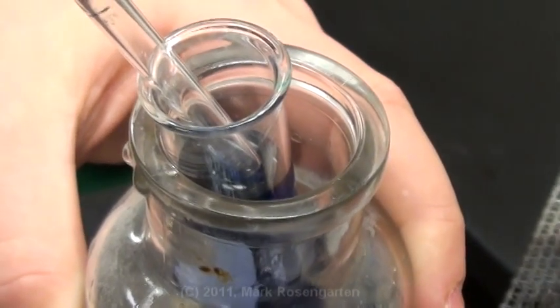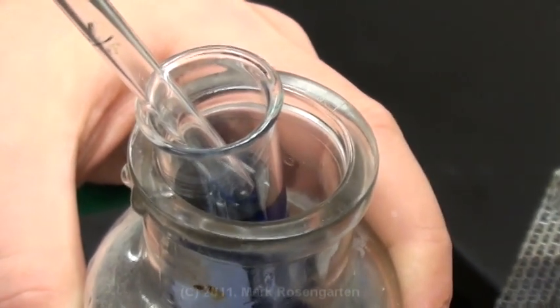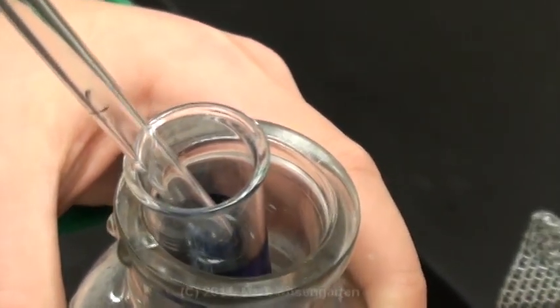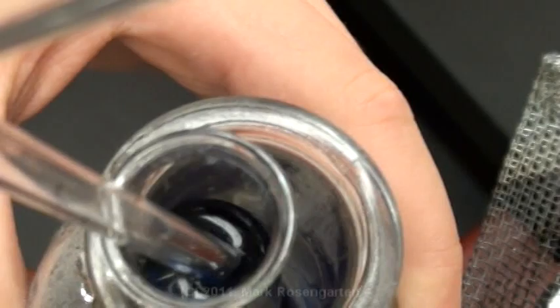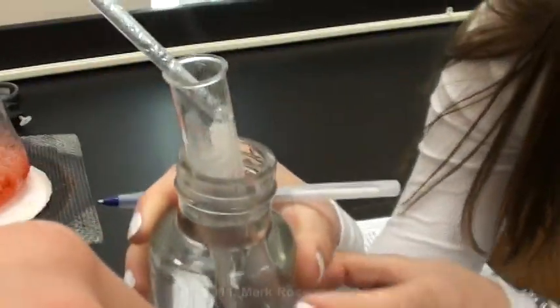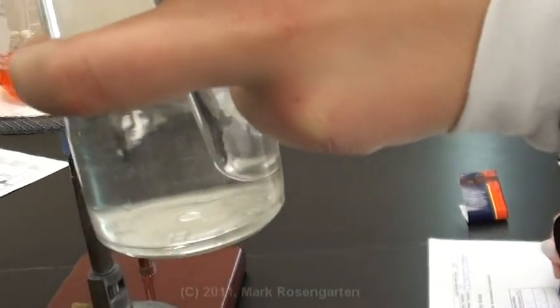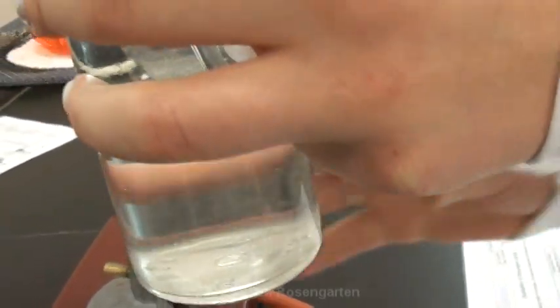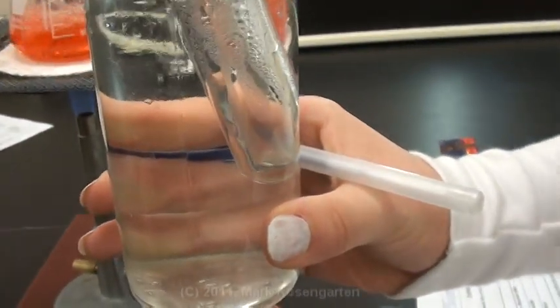Bromethymol blue is blue at high pHs, and as you lower the pH through acidification with carbon dioxide, the color turns green and then to yellow. You only have to let it go until you start seeing green. There! Yeah. It's going so fast now. When the bromethymol blue turns green, remove the bromethymol blue test tube and replace it with the other test tube. 96.2. When you get drops of clear liquid into your test tube, record the temperature, turn the burner off, and you're done.